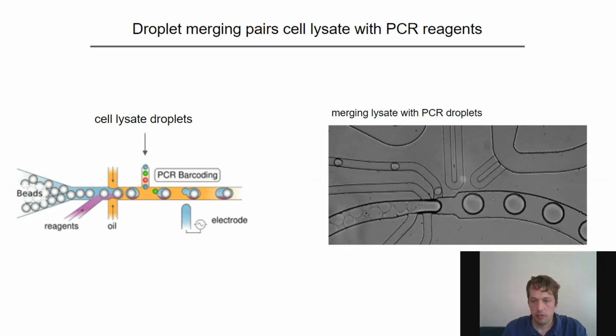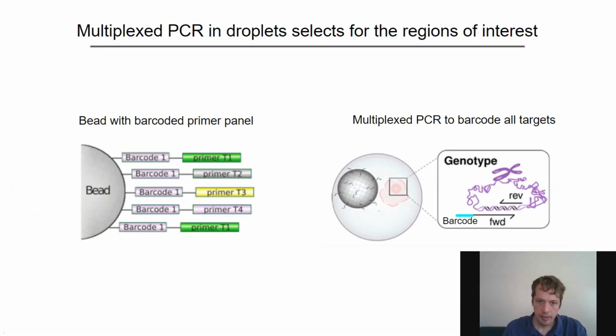So you see on the right the droplets coming in from the top, containing the cellular lysate, and they are paired with a secondary droplet that is just formed on the chip, containing again a barcoding bead and a PCR reaction mixture. We can then harvest these droplets again. These droplets contain the said barcoding beads. So the barcoding bead is a scaffold, bringing in again the primers.